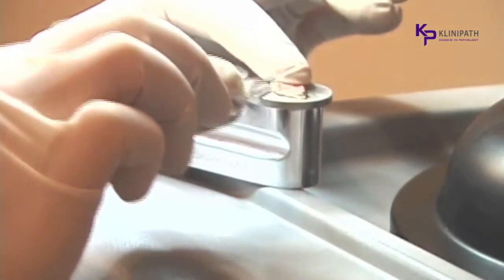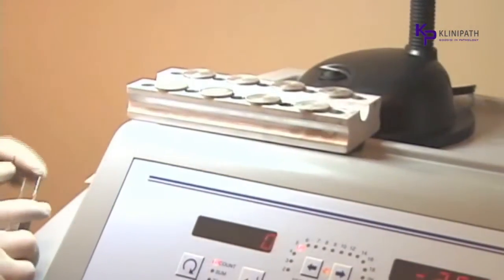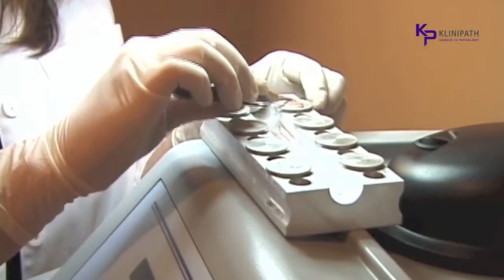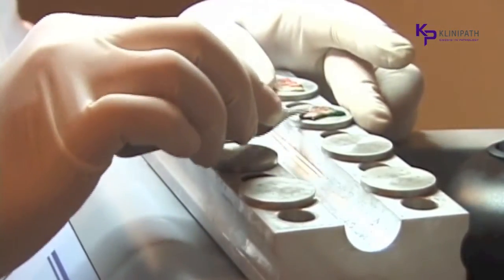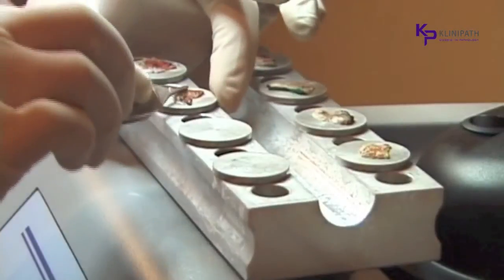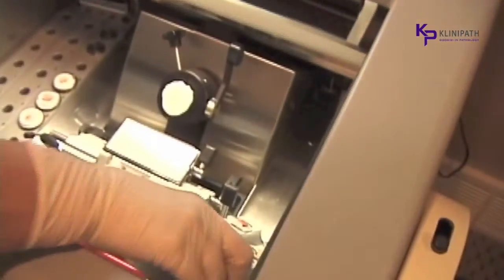Many offices do MOHS on very large sites. Specimens this size have to be cut into smaller pieces in order to fit on a microscope slide. Using the button holder that comes with the Cryoembedder system, eight pieces can be oriented and frozen to where they are ready for cutting in less than three minutes. The mass of this piece of equipment will retain its temperature for long periods of time outside the cryostat chamber. All eight of these pieces can be viewed at eye level and easily turned to see all sides. Even when demonstrated slowly for teaching purposes, all eight pieces are oriented and frozen in just over one minute. It will take another two minutes to assembly-line embed them. Place the cutting chucks back into the holder and begin cutting this case.